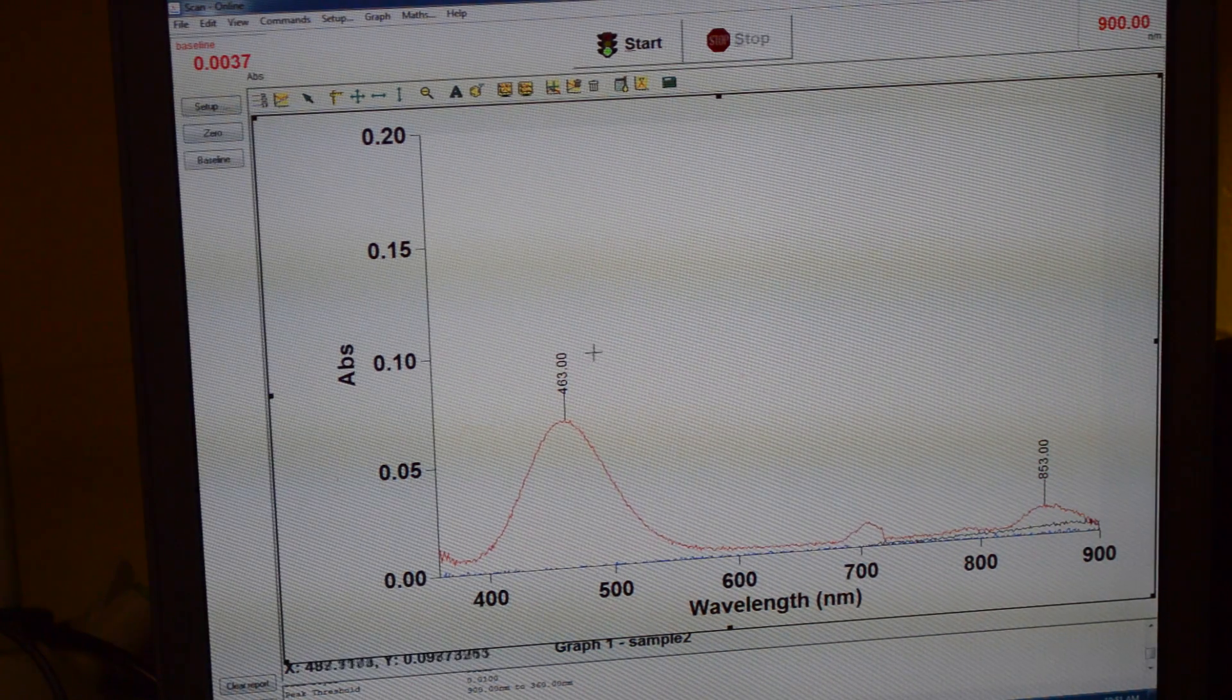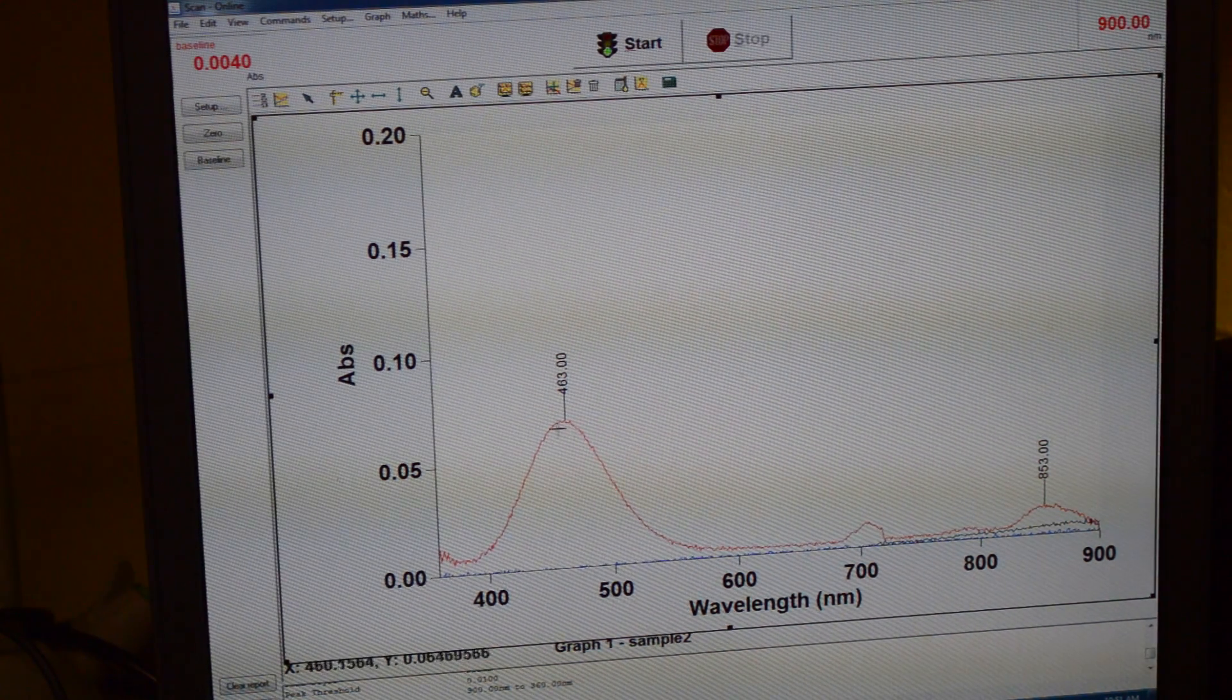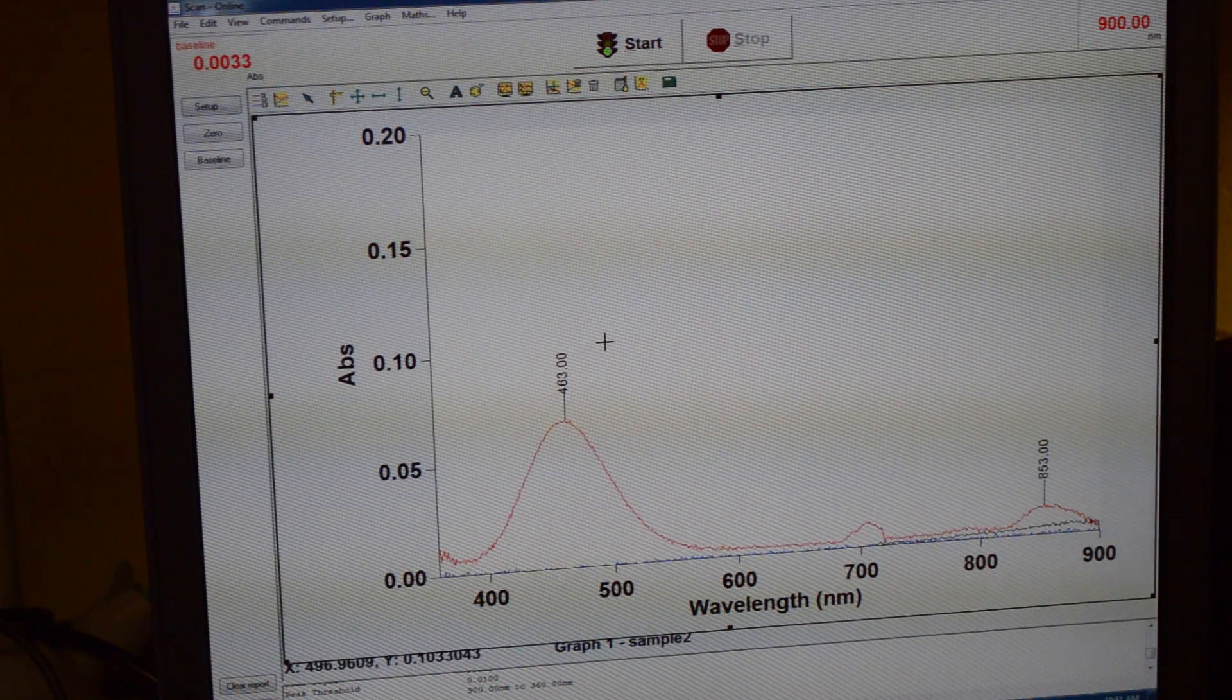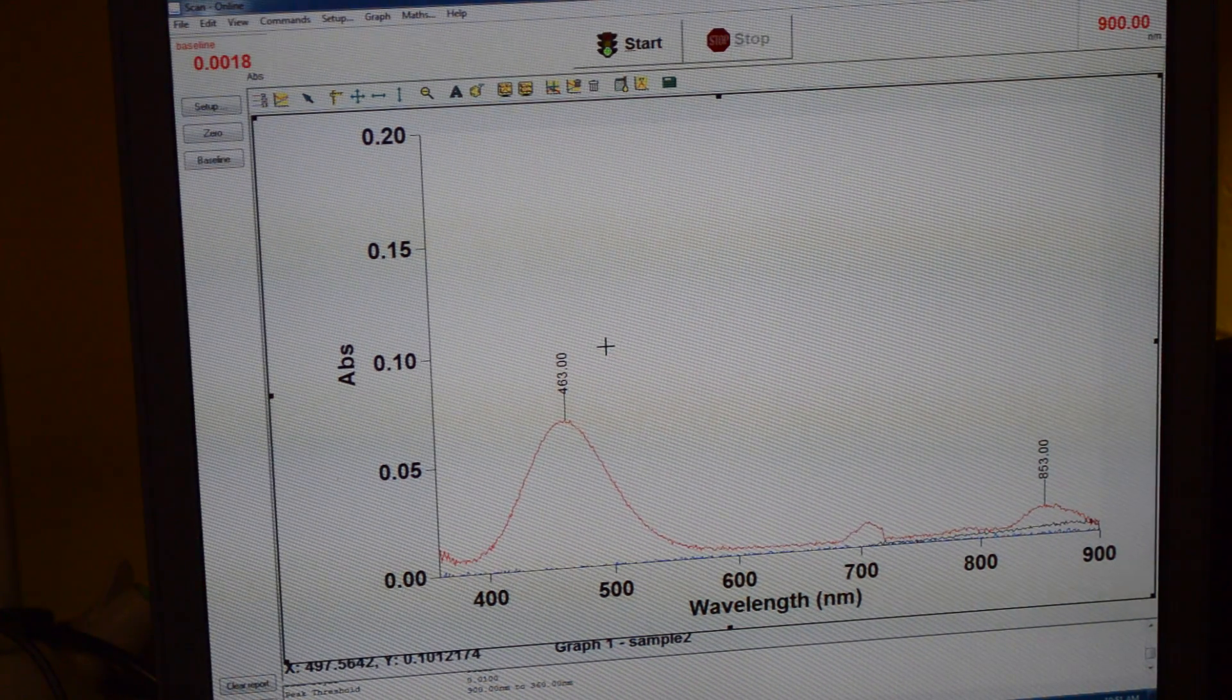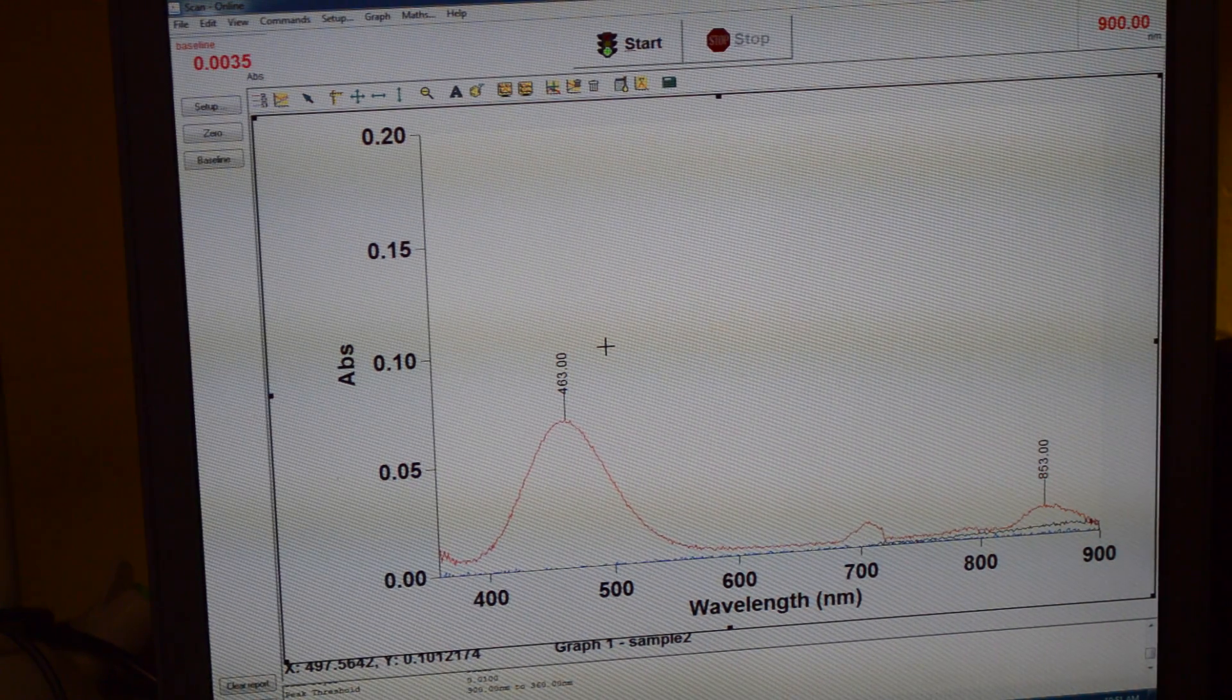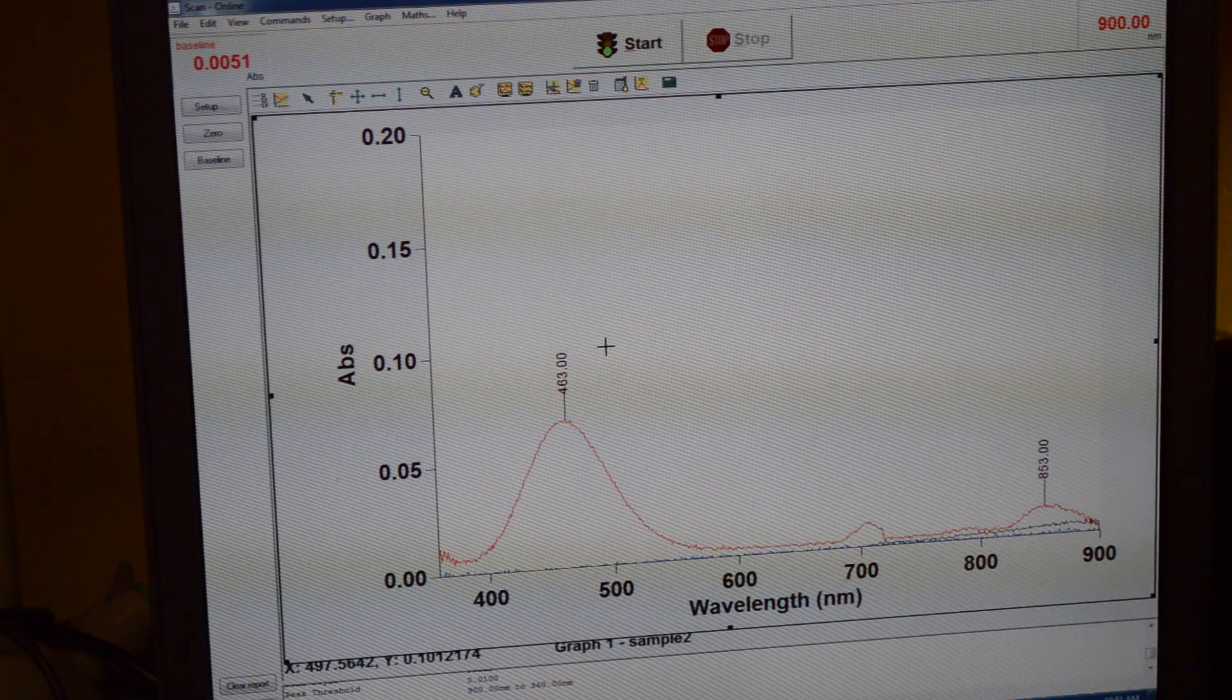As this is the point of interest, we do have the correct x coordinate that we are looking for here. From here we can print the graph to the printer and always remember to put your compound structure on the sheet when it is printed.